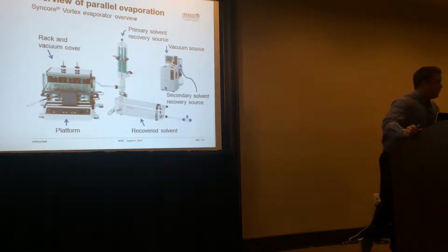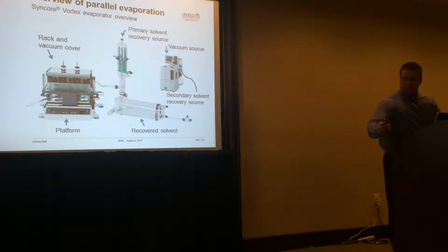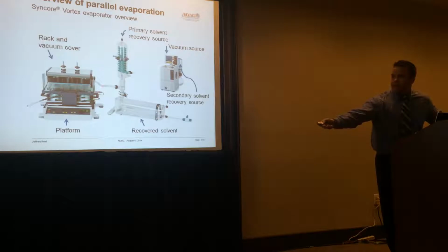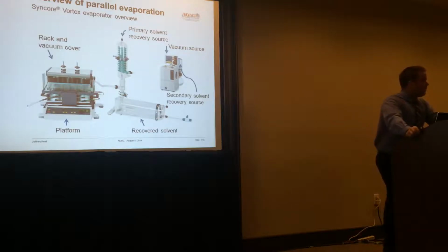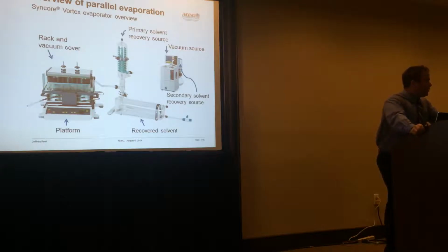That's what generates the heat. Remember, that's the energy applied into the system. Okay? You have your rack, in your vacuum cover here, that's where the samples are held in parallel. So you're increasing your throughput. You're doing multiple concentrations at one time.